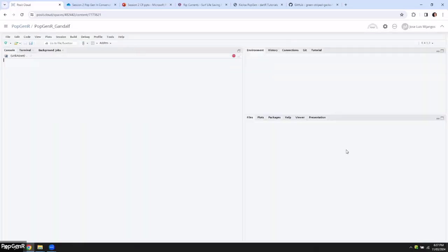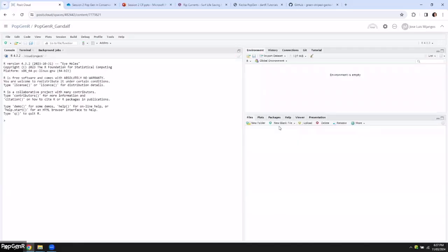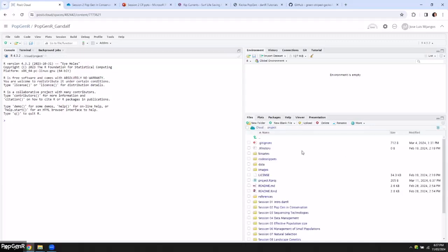That filter goes over each of your loci and says, you removed this individual, so I'm removing all the loci that are no longer variable. You can do that in the call rate filter, but I wanted to make a point that it's pretty important. Some things will just crash on you, like structure, if you don't do it.